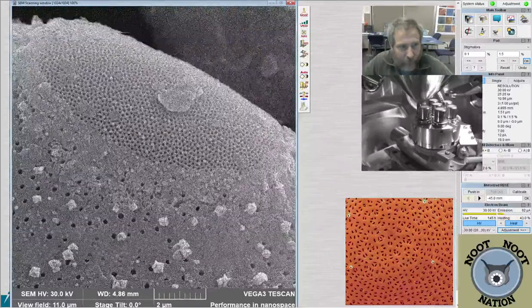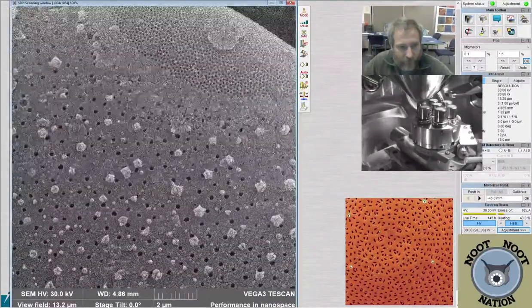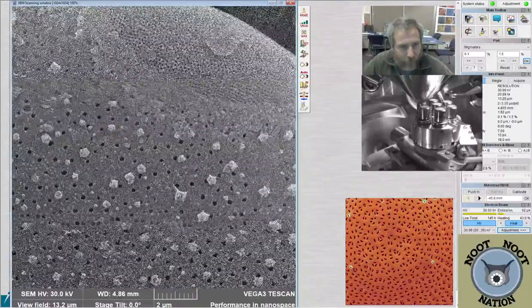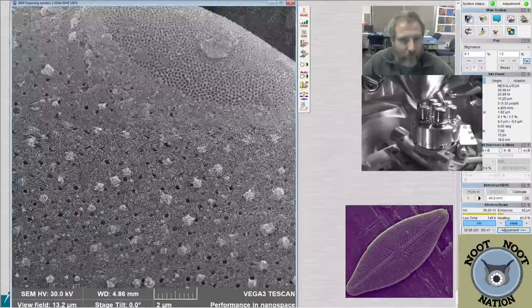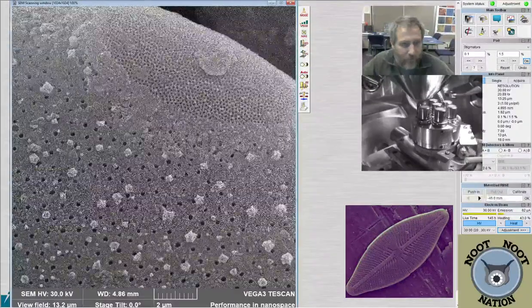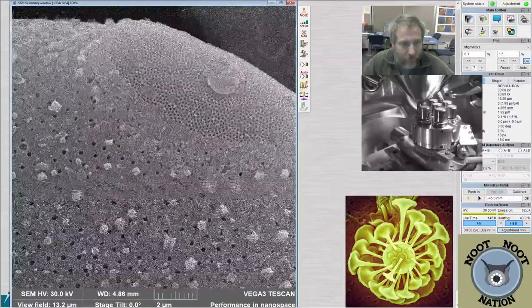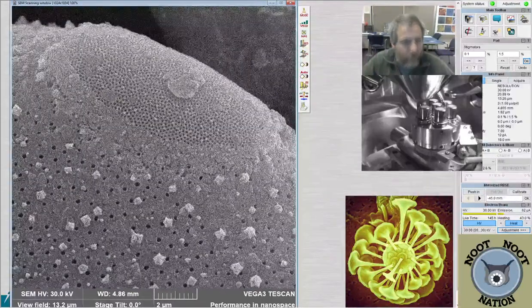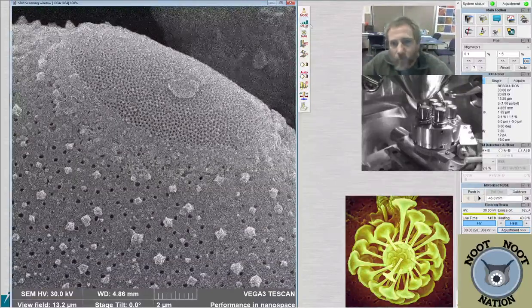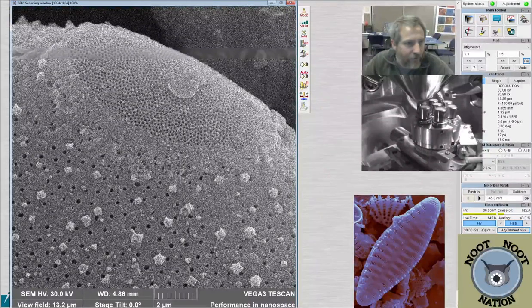Everything is pretty sharp, and I think we can see pretty clearly that boundary between the normal part of the cell wall and the little specialized component called an ocellus. So ocelli just means eyes, but in our case they are represented by these little tiny pores that we see in a little field, a pore field basically. Get us a nice image of that as well. You can see how clean and clear those images are, even at this magnification.